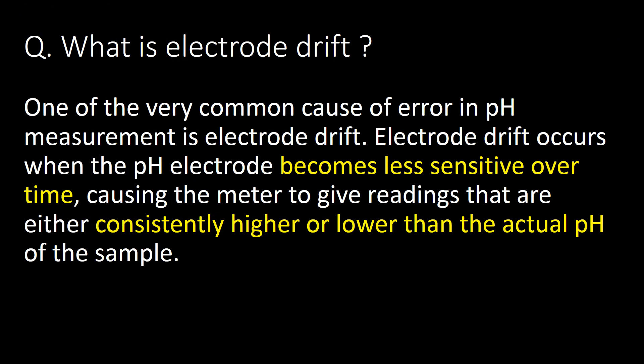What is electrode drift? One of the very common causes of error in pH measurement is electrode drift. Electrode drift occurs when a pH electrode becomes less sensitive over time, causing the meter to give readings that are either consistently higher or lower than the actual pH of the sample.